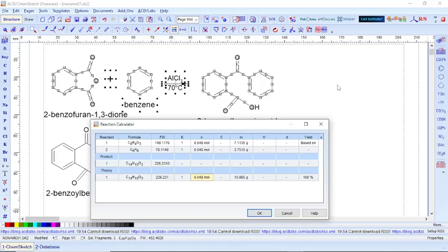Yeah, I'm asking the question. We are in the lab now. How will I measure 3.7515 gram of benzene? I mean, is it not we use our balance or something to measure it? I don't think so.